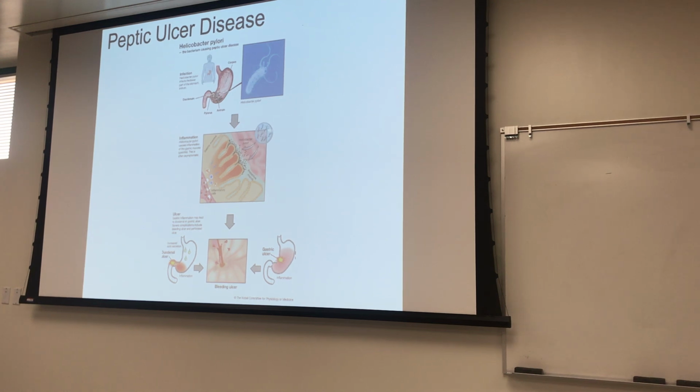So when you get an ulcer, it's like an open sore that starts to build up. They can bleed. They're really, really painful. And anyway, the urease test can actually help to diagnose this condition, which is nice.